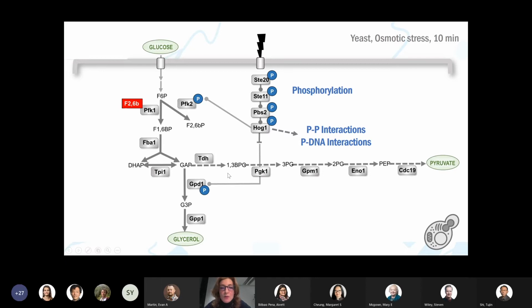So all that happens here for all the enzymes you see associated to these reactions is a decrease in the concentrations of substrates. So none of these events would be captured by a classical proteomic analysis, protein expression analysis, because the levels of all the proteins you see here remain exactly the same when this pathway is activated. So the question I would like to ask with my presentation is there a way to capture these various types of molecular events which occur almost simultaneously in a cell within the same analysis? Can we do that? Do they have anything in common?